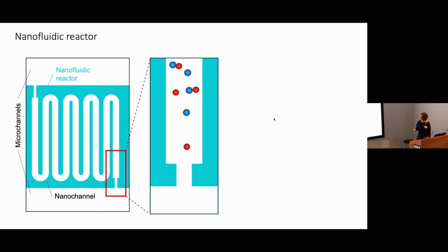So right now we are working on the idea to enclose a high number of molecules in something that we call a nanofluidic reactor, which is basically just one long nanofluidic channel that has some means at the end to enclose the molecules. We are working on two principles right now. One is based on a passive enclosure of the molecules using constrictions at the end that create an electrostatic and entropic trap that prolongs the time that the molecule spends in this volume significantly.